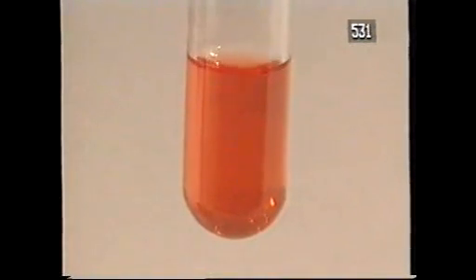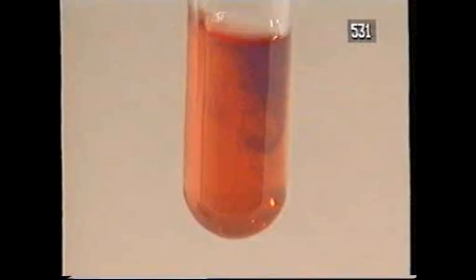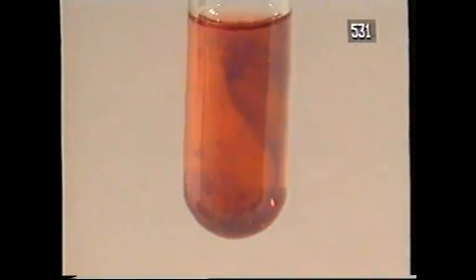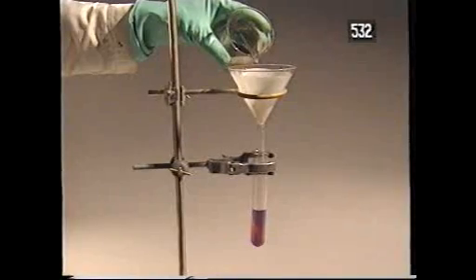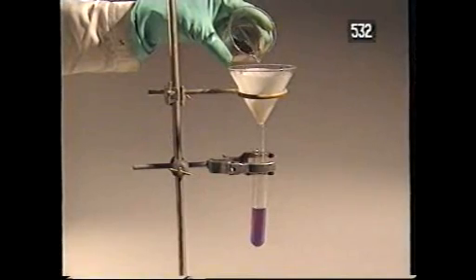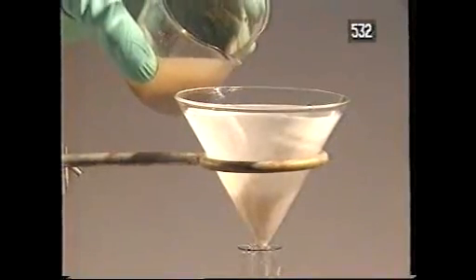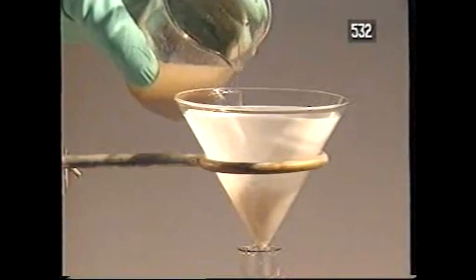As the solution comes through, it turns the litmus blue. Wood and plant ashes are alkaline. Solutions like this were once used to make the glass for medieval cathedrals.